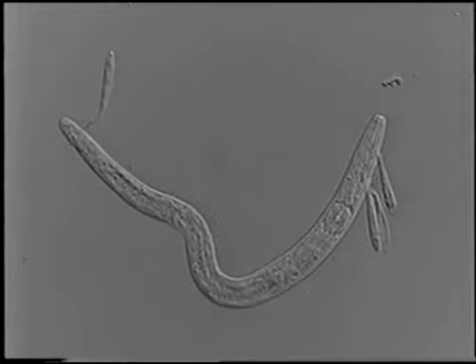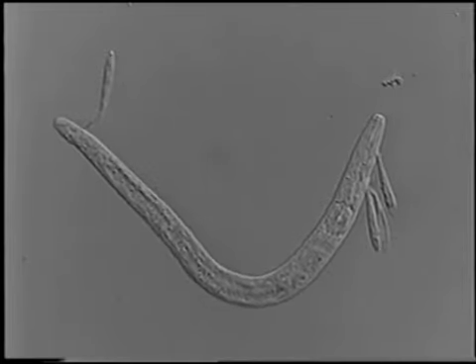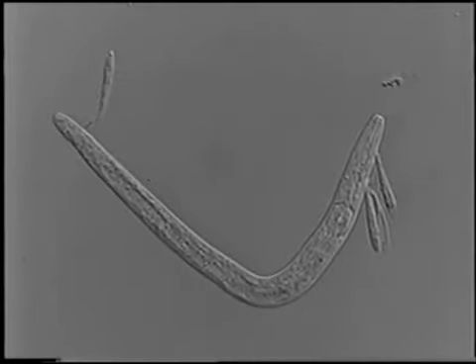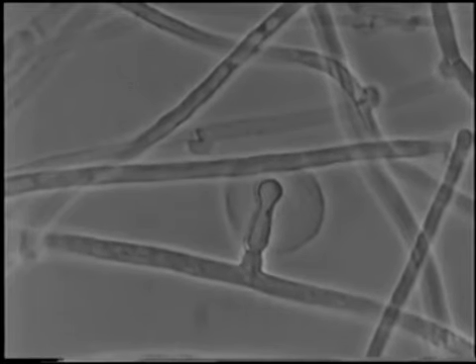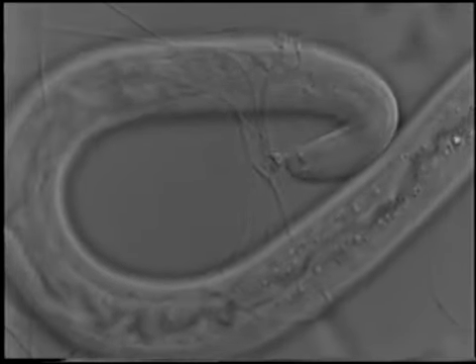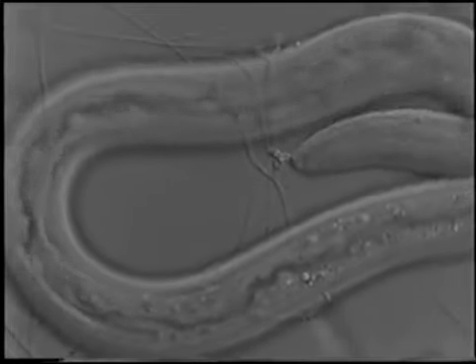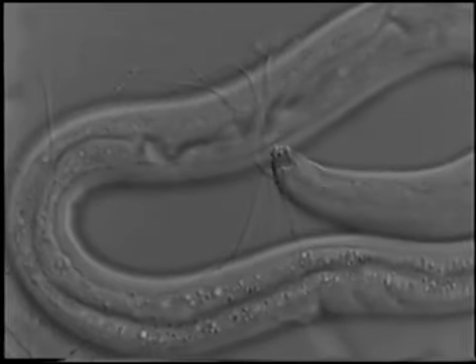As the infection continues, the nematode becomes immobilized and the fungus begins to digest its host. The nematode trapping strategy is used by Nematoctonus concurrens with the aid of its hourglass-shaped knobs, which are equipped with an adhesive substance. The head of a nematode is here seen in contact with a trap, and the nematode is attached to it. In spite of its efforts, the nematode is firmly gripped.